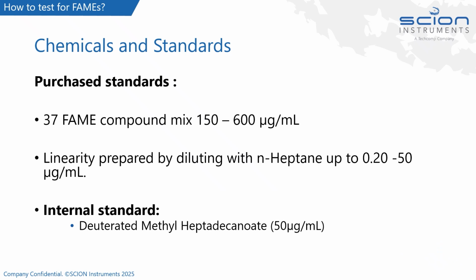For this application, a commercially available FAME standard was purchased. This contained 37 FAME compounds in a pre-made mixture with concentrations ranging from 150 to 600 microgram per mil. This standard was used for the qualification and then subsequent quantification of the unknown olive oil sample.